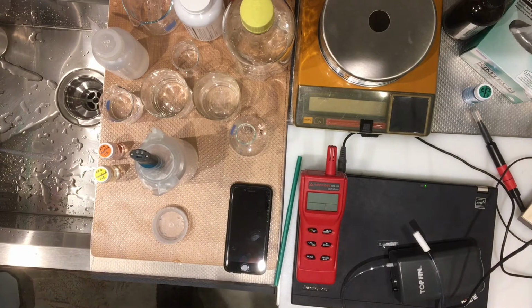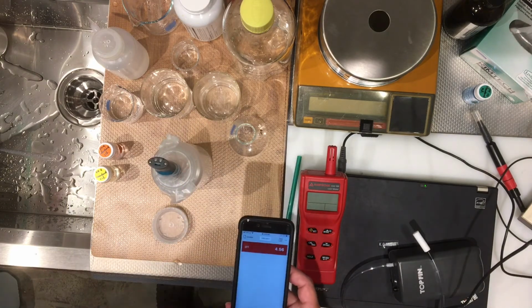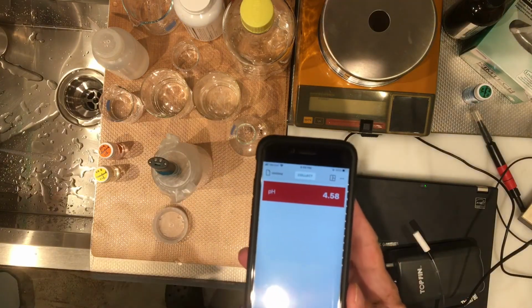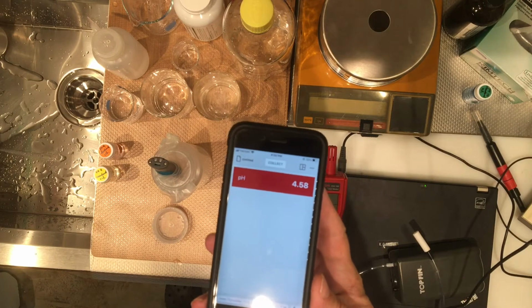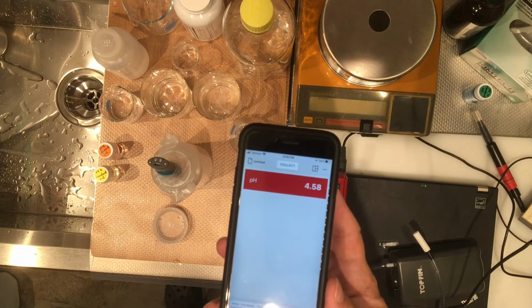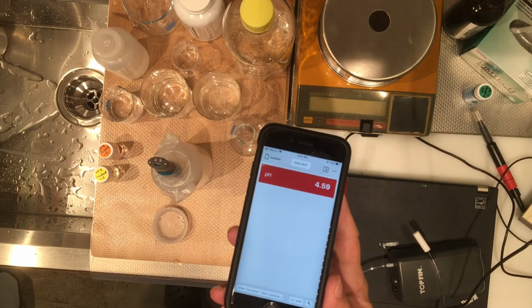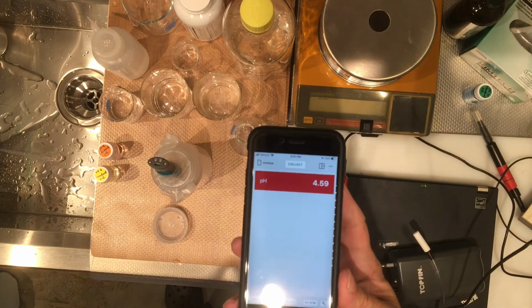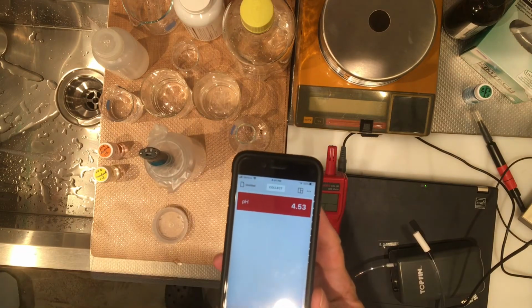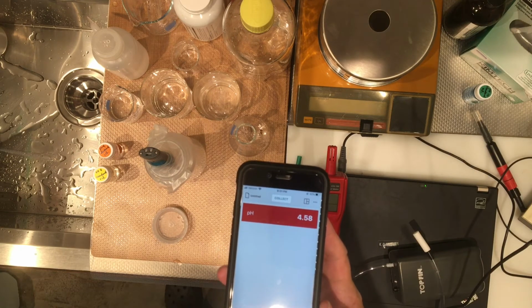All right, so let's go ahead and see what we get. You can see that the pH here is dropping, and it's definitely less than what it was before when it was in contact with the air, and it is getting to around 4.5859. Let's give it a little chance, see if it even goes lower. I think that's pretty good.